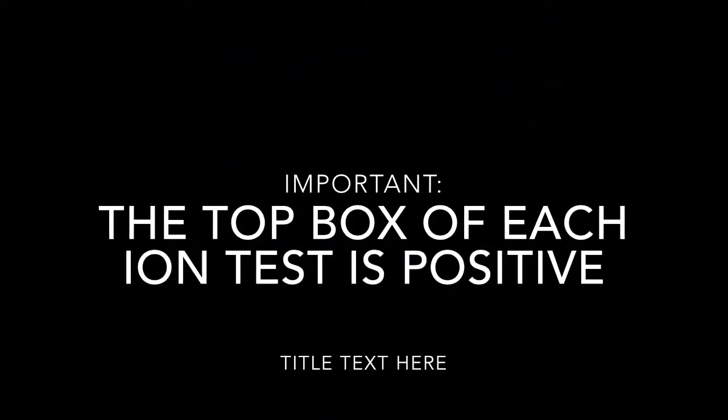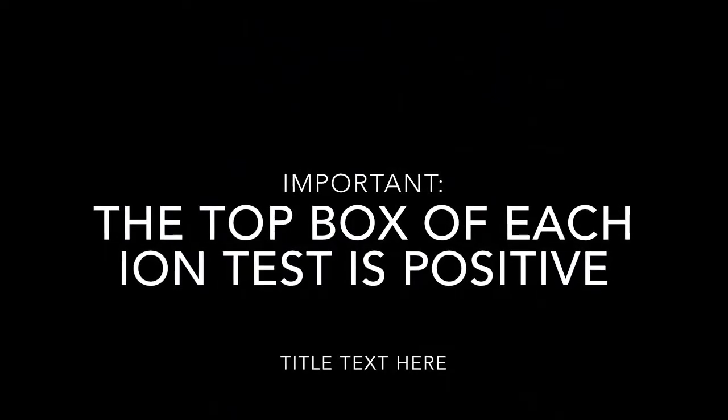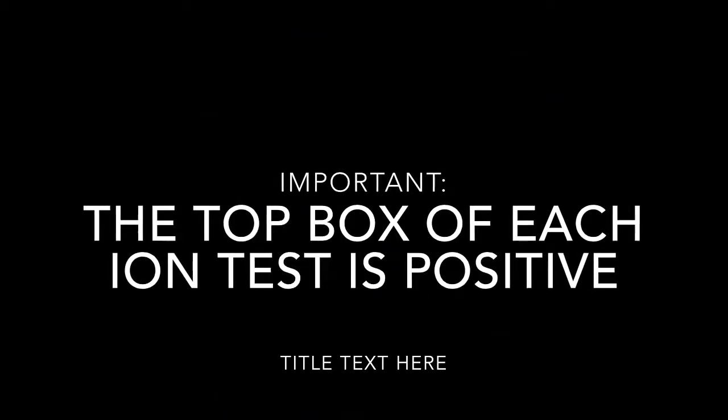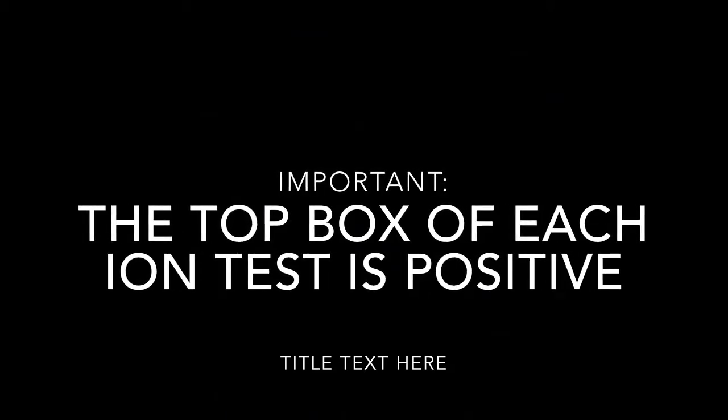You will perform each experiment twice. The top box will always be positive, and that is your base for comparison for your bottom box using your unknown. At the end of the experiment, you will be able to tell what the cation is for the unknown and its charge. You'll be able to tell the anion contained in the unknown and what its charge is. You'll be able to determine the formula as well as the name for the unknown compound.